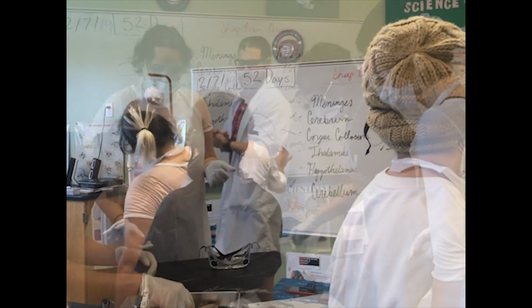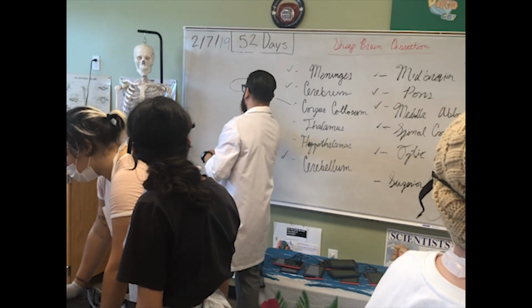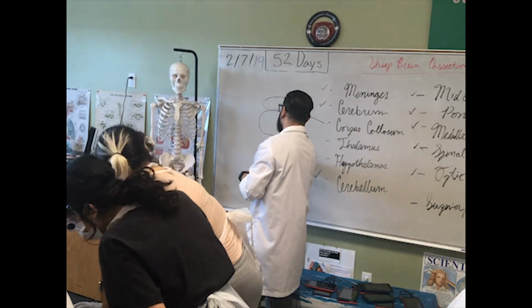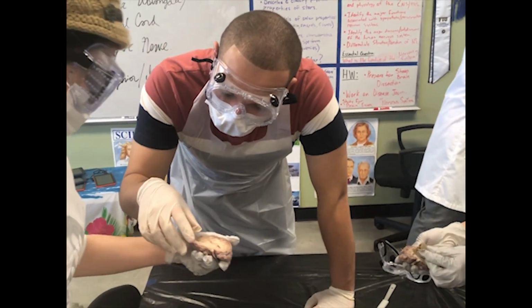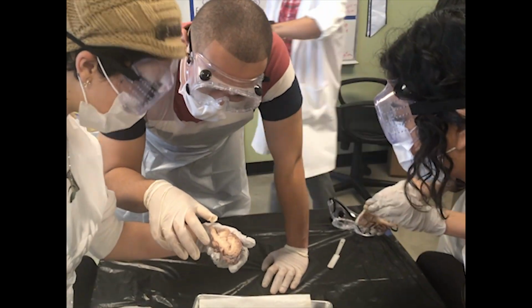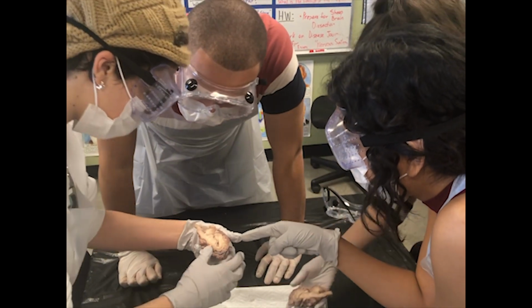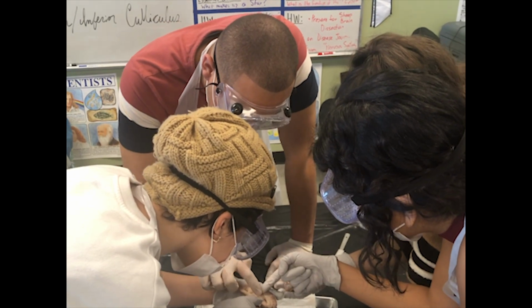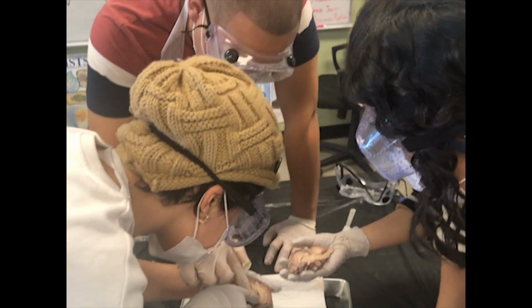Find those, please. The thalamus, look up here, I promise you. See if you can find it. It's gonna be somewhat of a circular-like object, and then when you find that bottom tissue, right under. We got 30 minutes, folks. It's gonna be right under what we just had. I think it's this right here. Yeah, circle. This one right here.